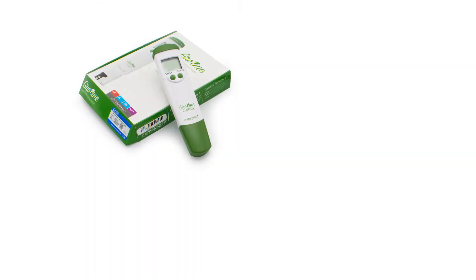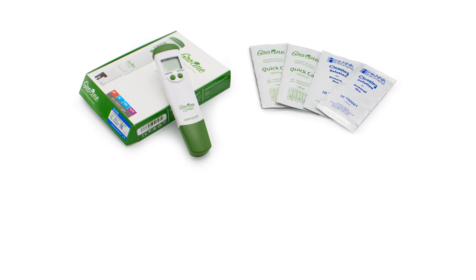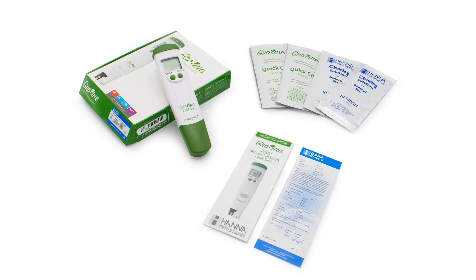The GroLine combo tester comes with everything you need to begin testing. Along with the tester comes our GroLine quick calibration and cleaning solution packets, manual, and quality certificate.